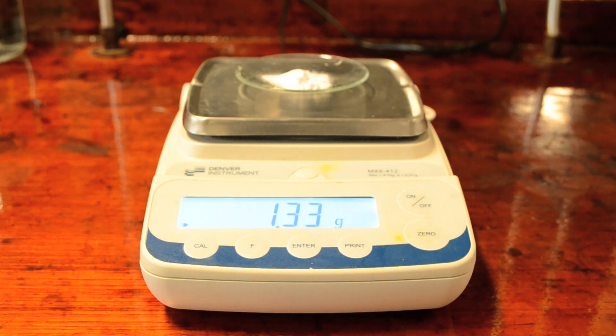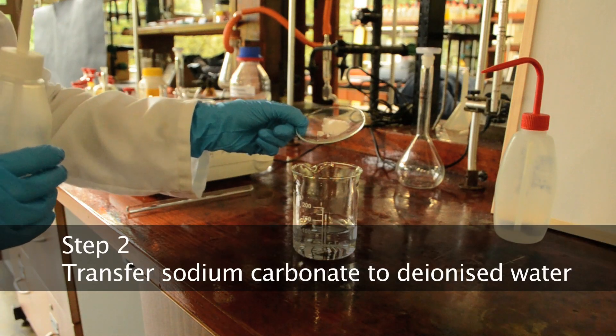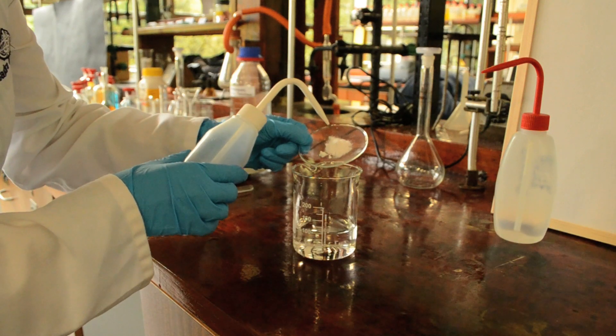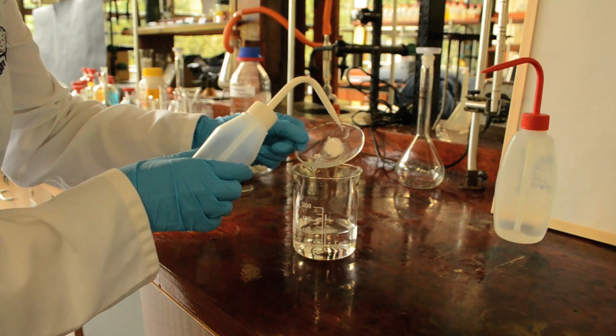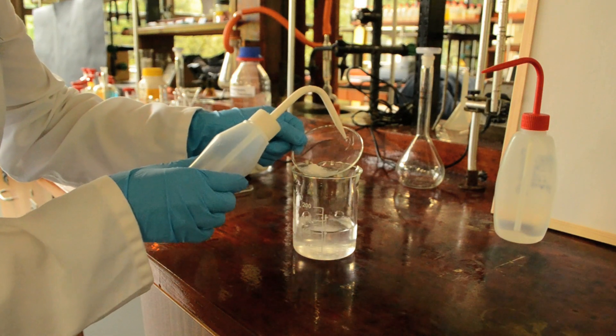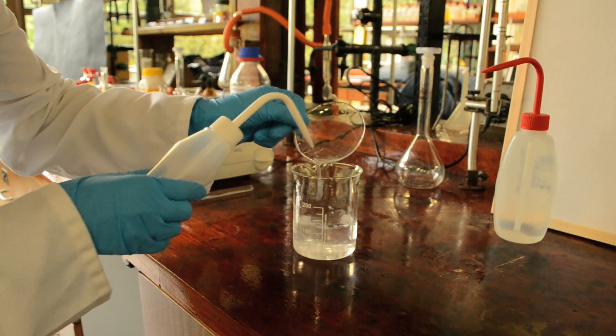Okay, 1.33 grams of sodium carbonate weighed out. I'm going to transfer the sodium carbonate into the beaker by washing it down from the clock glass using deionized water, making sure to wash every little bit of the sodium carbonate into the beaker.